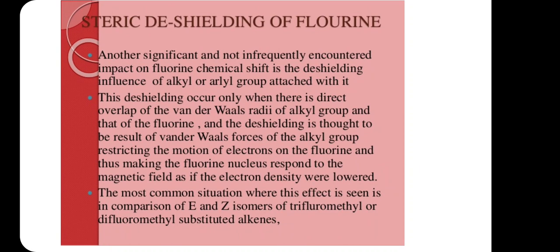The most common situation where this effect is seen is in comparison of E and Z isomers of trifluoromethyl or difluoromethyl substituted alkenes.